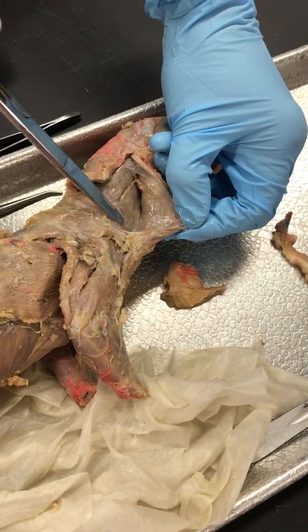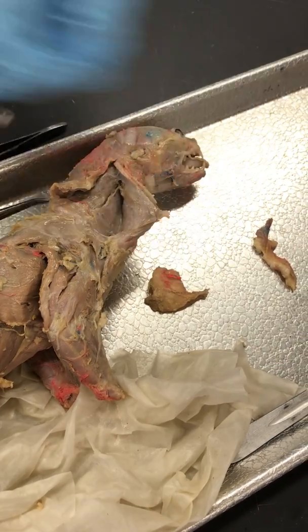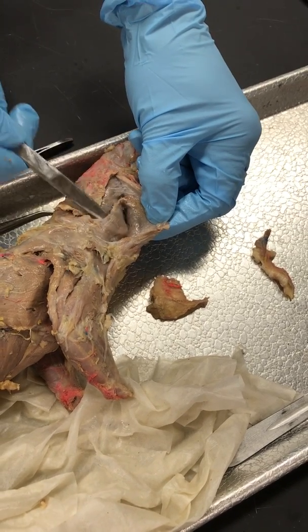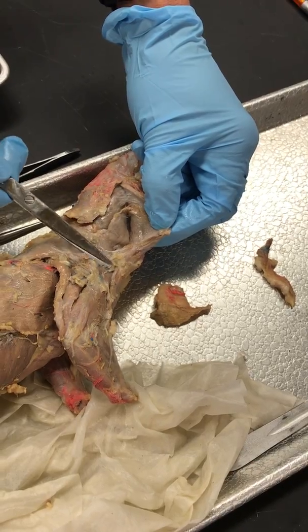That's Homo Transversarius — it's kind of flat. If I get up under it, it's kind of like a long skinny muscle. And that goes over to his shoulder.